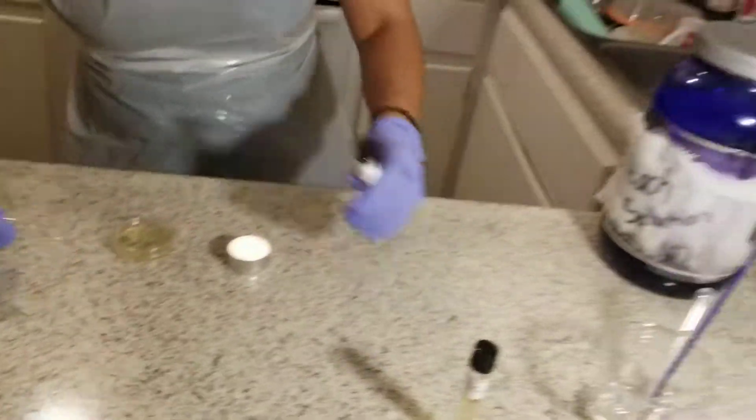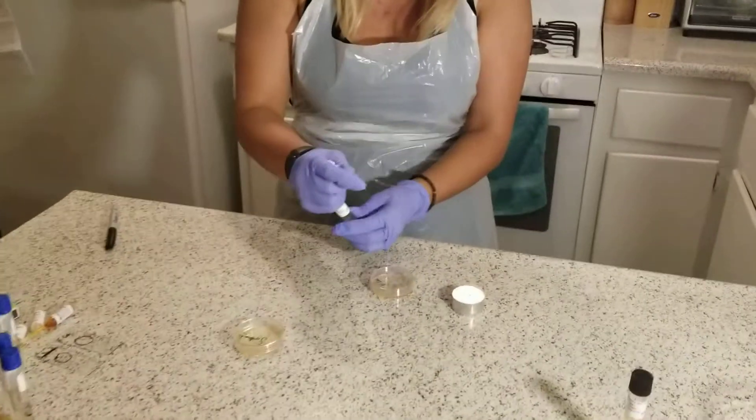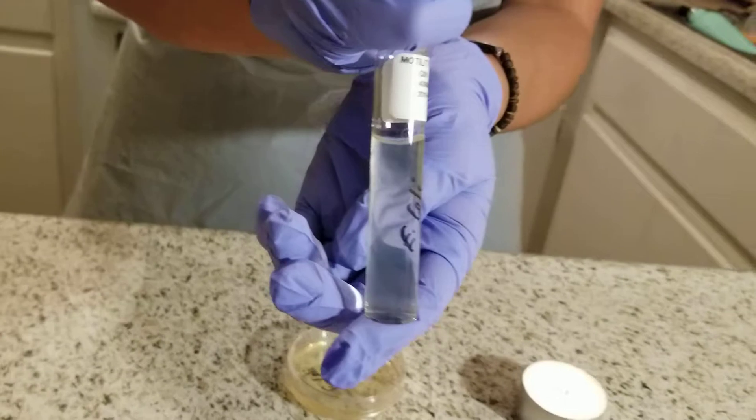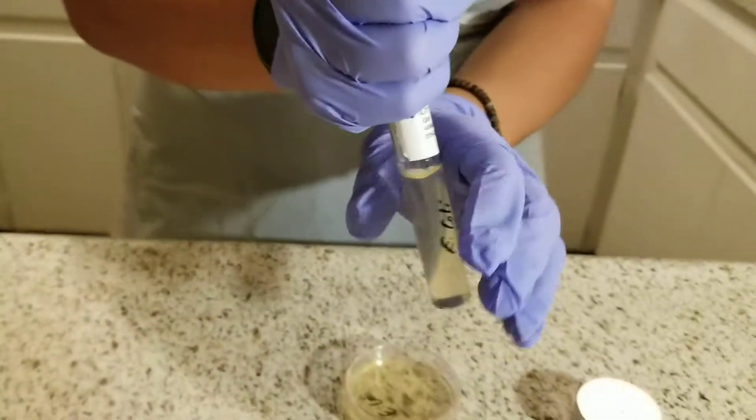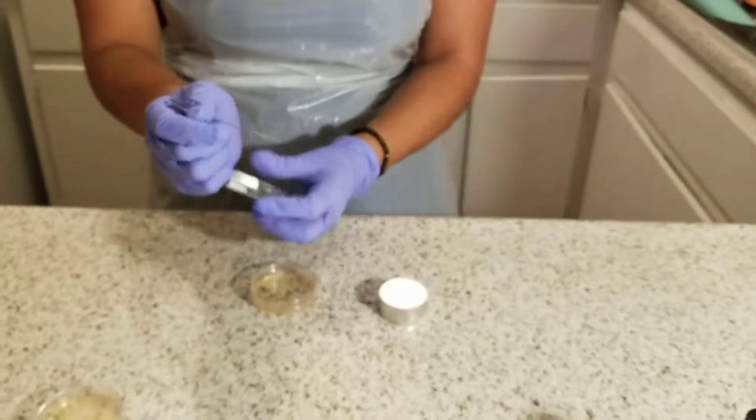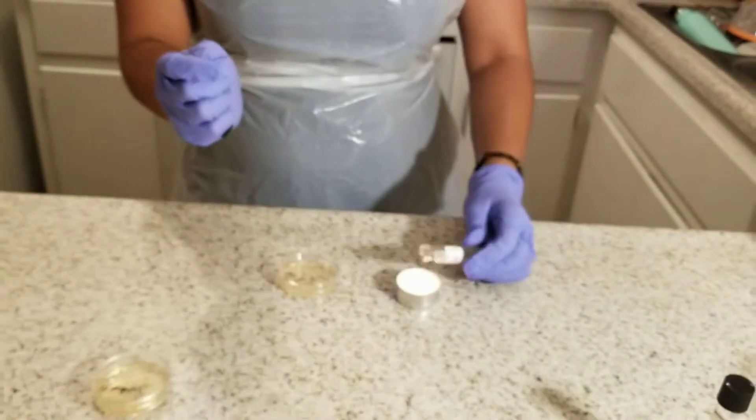Then I get my motility tube labeled with E. coli and sterilize the lid by passing it over the flame.